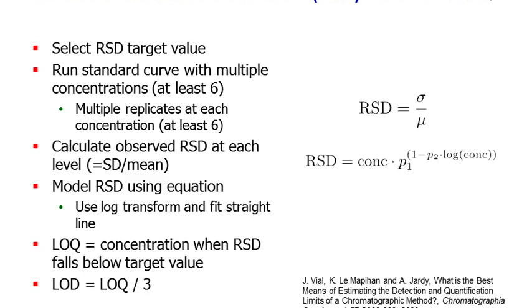So you calculate LOQ, and then you calculate your LOD as 1/3 of that. The reasoning is that when you want to be precise, when you want to worry about precision of quantification, why don't you just look at the precision, model the precision along the calibration curve, and find a point where the precision is like at the limit that you want it to be. So that's kind of the philosophy behind this.